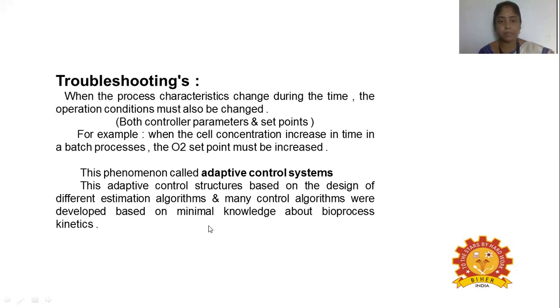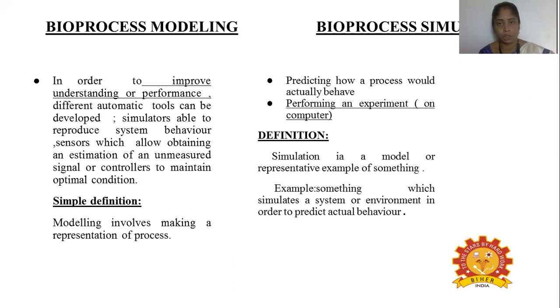Here, this adaptive control system has to be designed based on estimation algorithms and various algorithms, with the minimum knowledge that we have to know about that particular bioprocess reaction carried out in the reactor, as well as understanding the kinetics involved in a particular product formation.